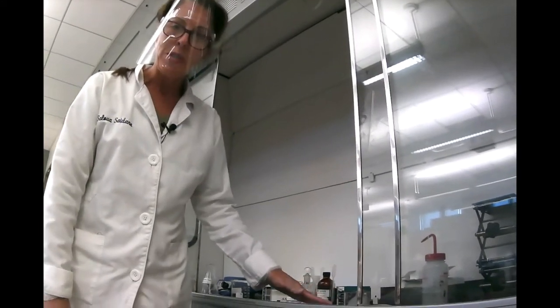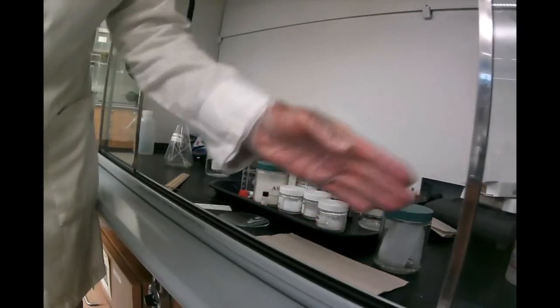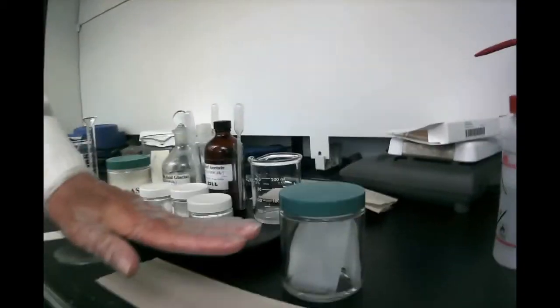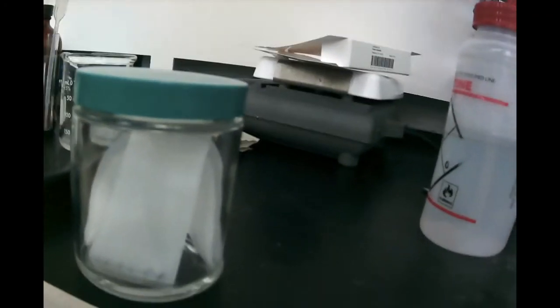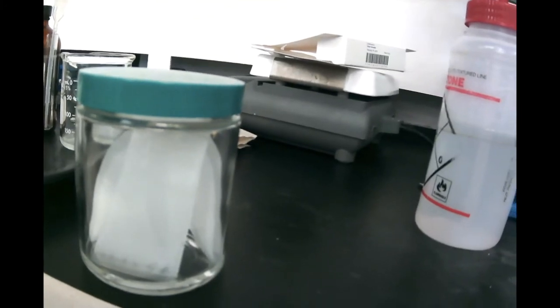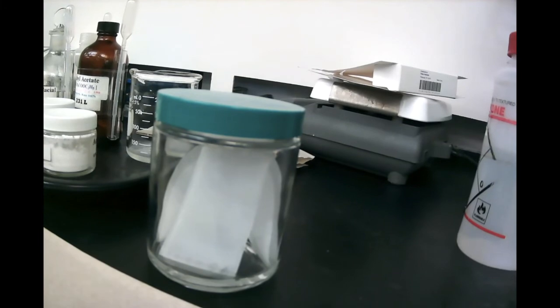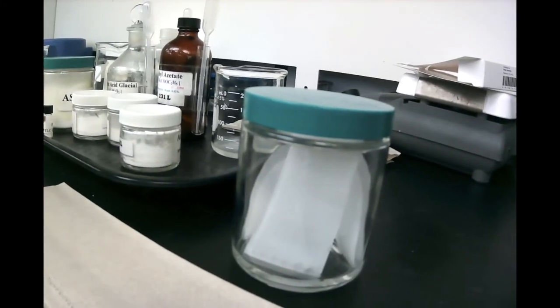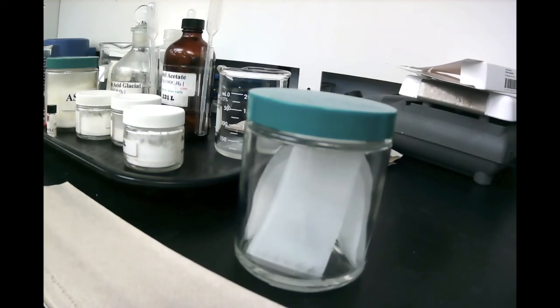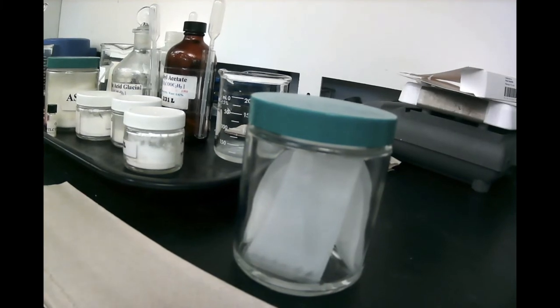So we're almost done developing this plate. So what does it mean, done developing? It's when your liquid reaches that line that we're going to use to calculate the distance the liquid traveled compared to the distance the substances traveled. So you have to keep an eye on it and get really, really close. And it looks like for us, we're almost there. It takes about 7 minutes to develop the jar.